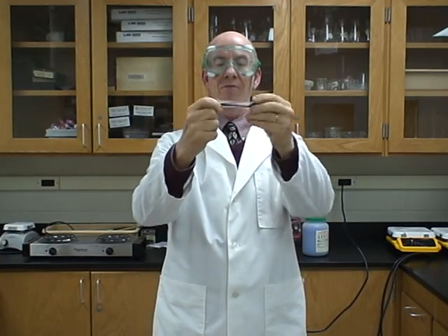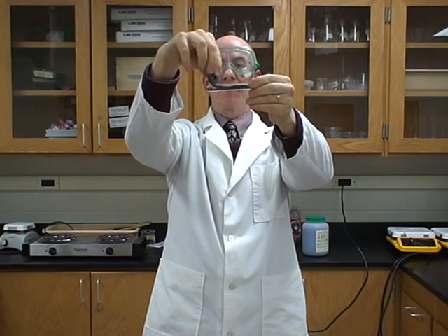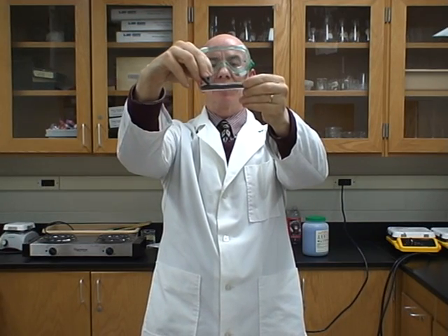For the next example, I've got iron filings inside a test tube, and I hope you can see this. Okay, and I've got a pretty good magnet here, and I'm going to bring this magnet. You see what it does already? It's like magnetizing a piece of metal. If you notice, to magnetize something is just to align them in a certain direction. So if I bring it through, okay, is that a physical or a chemical change?